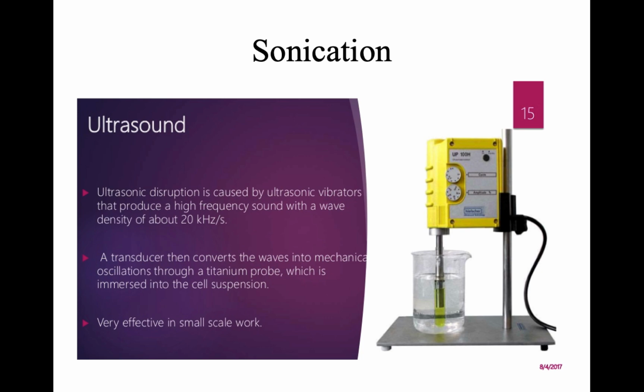But in sonication, where ultrasound is used, it results in heat generation. To avoid the heat generation, this method is done in ice at 4 degrees Celsius. At the same time, a small volume of the biological sample is sufficient for this process.